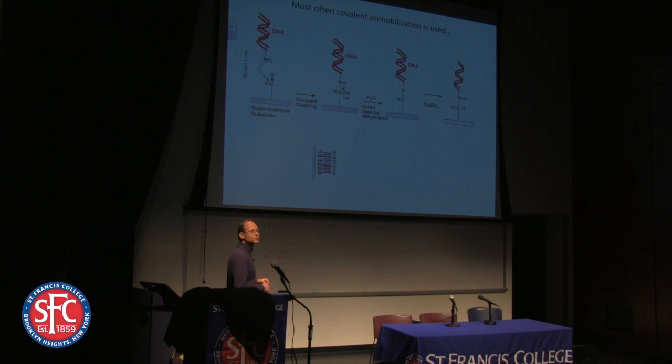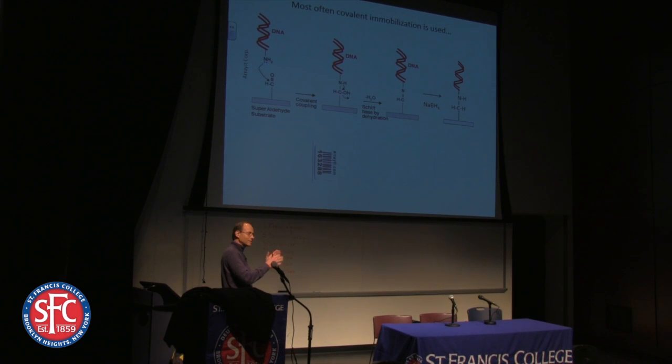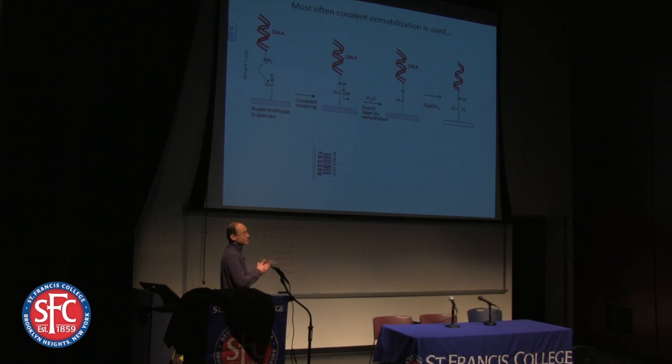So there's different chemistries we work with. If you have a really good commercial supply, these slides are reactive, so it's a bit tricky because you have a reactive slide that you get, but you don't want it to react until the very moment you want to use it. So you kind of want to keep it clean and everything. If you have a good source for those types of slides, then I think it's easier to just buy them, but they can be made in-house if needed.